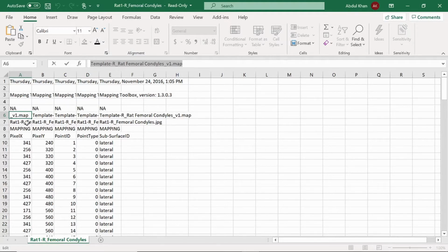The next row entry is the image used for the selected characterization. This is a reference to the image related to the characterization. This image must also be present in the same results folder and must have a resolution of 1280 by 960 pixels and a JPEG format. This field can also be left empty.